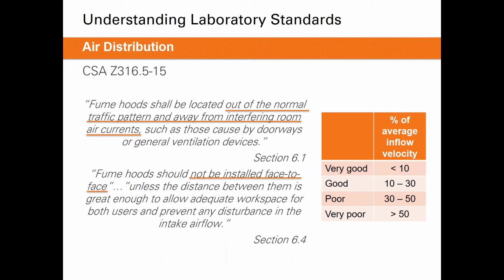be installed face to face with each other with a small distance between them. So if we have two fume hoods in a narrow room that are 3 feet apart, well, that 3 feet, first of all, may not be enough room for two people to work on each of those fume hoods without being directly back to back, which won't be super convenient. The other thing that can happen there is that when the fume hoods are open, they can create turbulent air in front of themselves and actually pull air out of the other fume hood. So we want to be careful with placing fume hoods face to face, making sure that there's enough distance between them and that they're not affecting each other as they're controlling the face velocity.